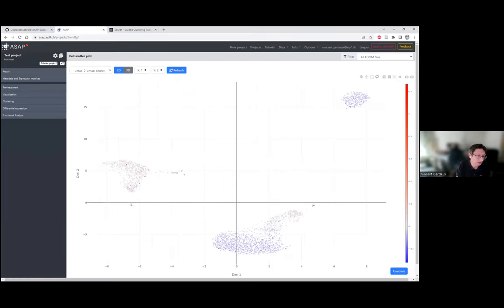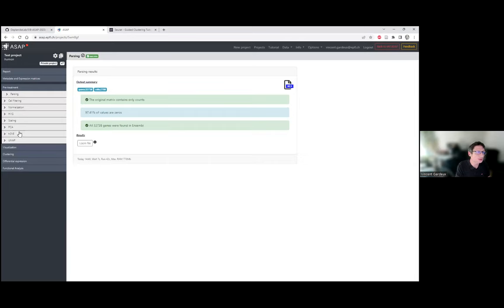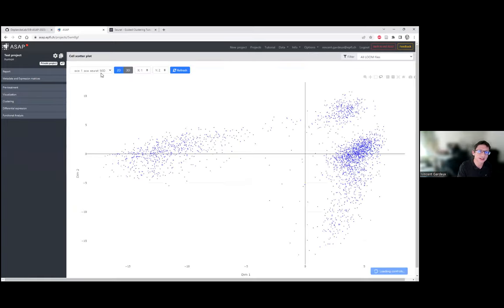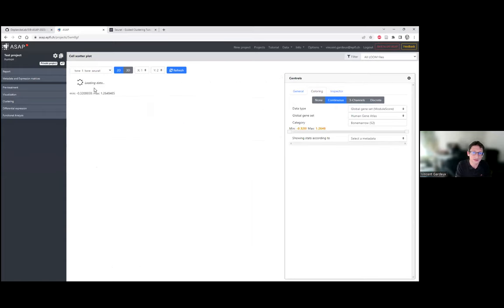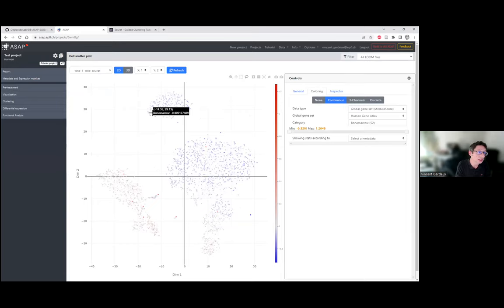Okay, so maybe let's do a quick round. We stopped at the point where we did all the pre-treatment things. We ran the t-SNE, and we ran two UMAPs, one with 10 dimensions and one with 50 dimensions. Now in the visualization part, you can visualize all of this: the t-SNE, the PCA, and the UMAP. Usually nowadays people are mostly working with UMAP data.